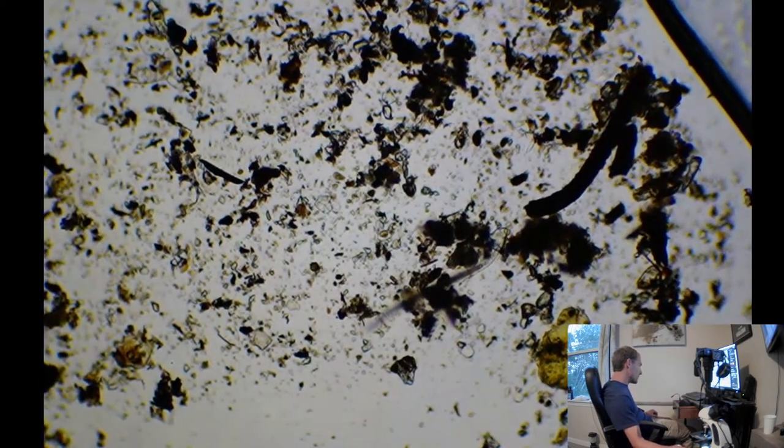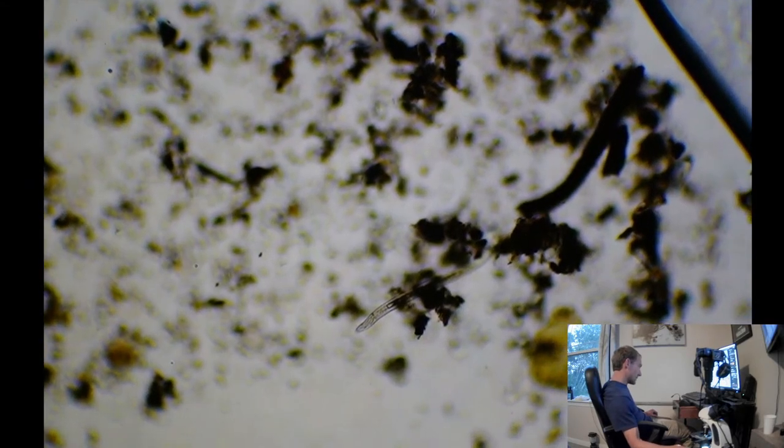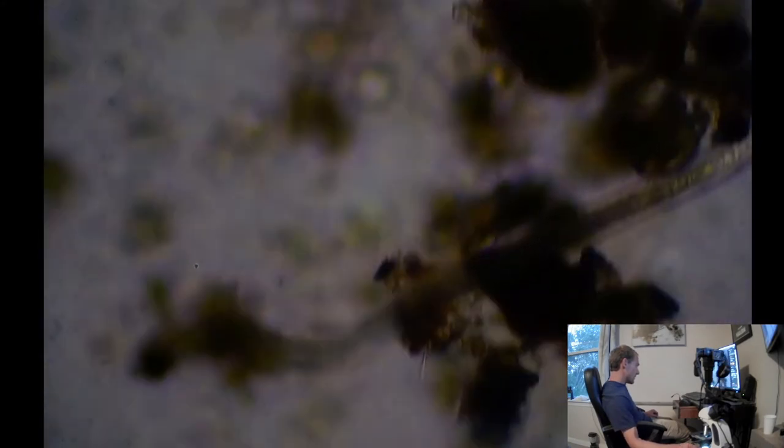Another nematode, two nematodes. Oh, this one's not moving. Let's look at him nice and close. We can identify this one for certain. Let's go in. Oh, more light. Get focused. There you are. One more light.